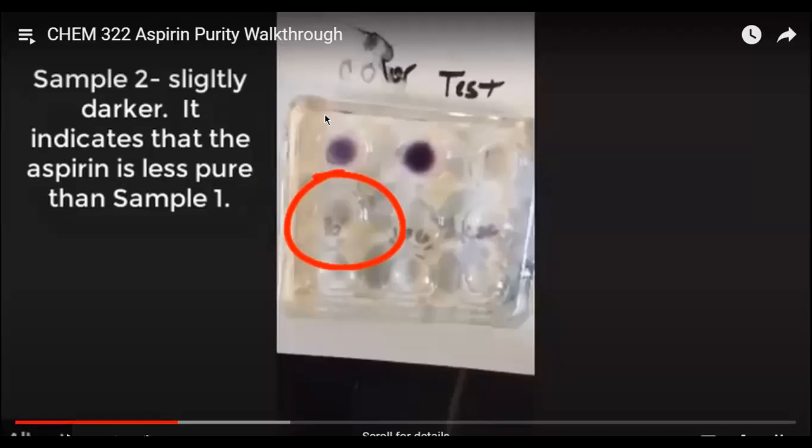So if we recrystallized it and it was still dirty, the best thing to do would be to recrystallize it again. And most of the time, if you're dealing with this on an industrial level, if they're not using some other purification method, they'll just recrystallize it more than once.